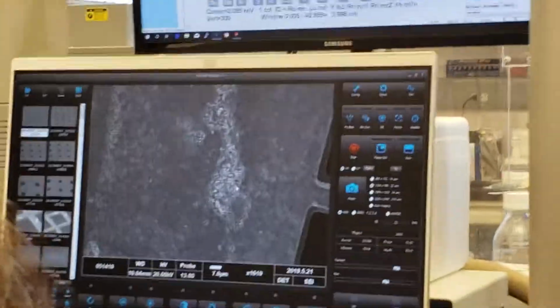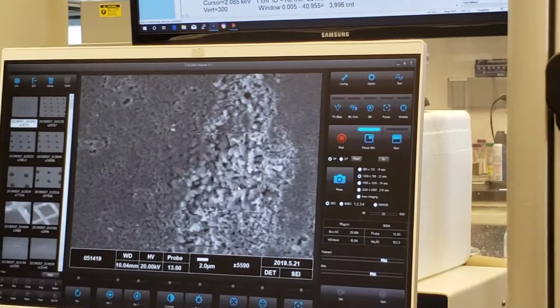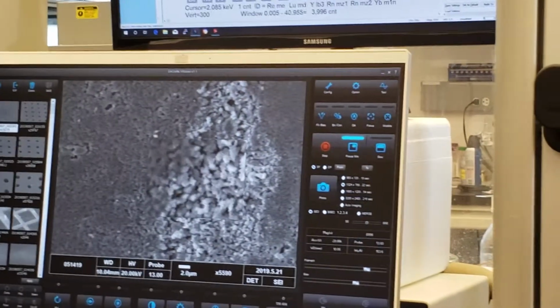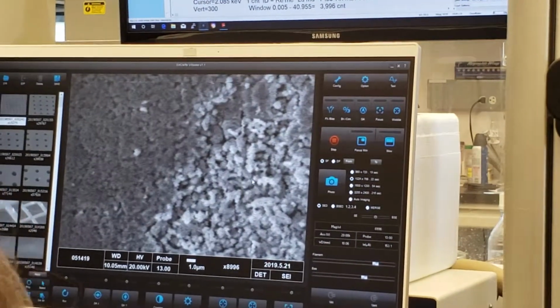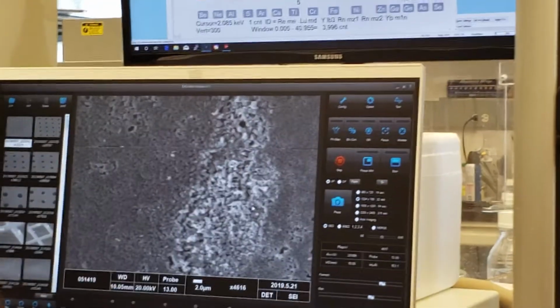Back to jump turn. Back to image. And over here is... Why do you close the software and... I mean, I haven't run the new bundle for a long time, so I don't know if the new bundle's got some bugs because we updated your software bundle. Yeah. So I don't know if that has a bug or not. We're going to have to keep our eyes on that.